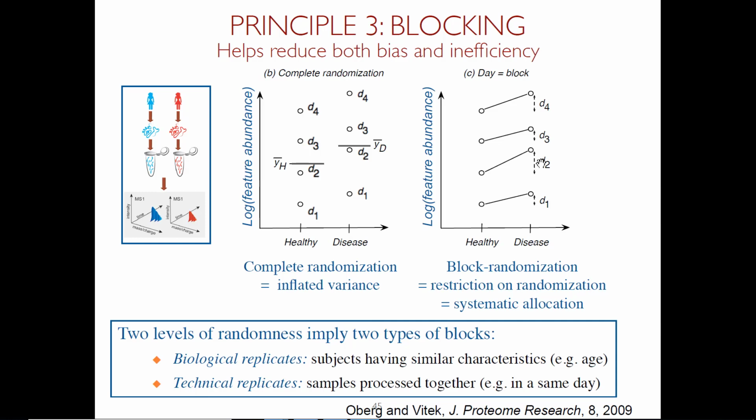Yeah, go ahead. In the case of identifying day-to-day variation, how many times should you do pairwise comparisons like that? Oh, you don't. You can. The best way to understand that you have day-to-day variation is just to run some QC samples up front. And you run it just for several runs, and then just look at the variance, and you say, okay, how big the variance is, right? And you can compare this with the variance that you would have from biological samples.